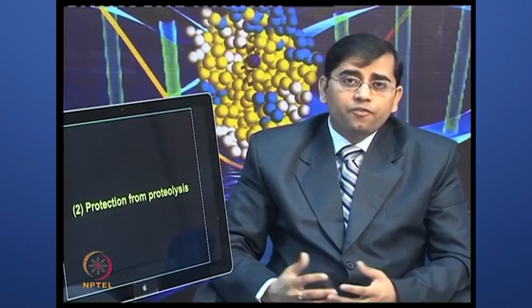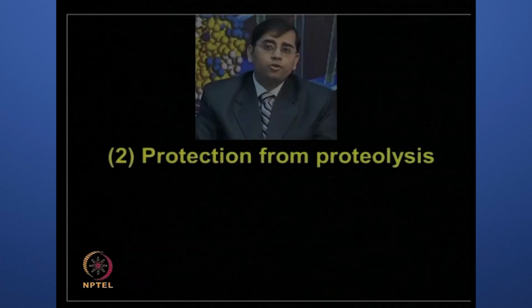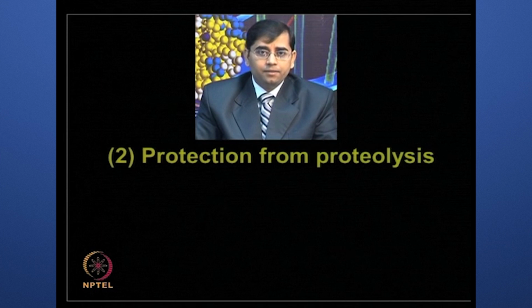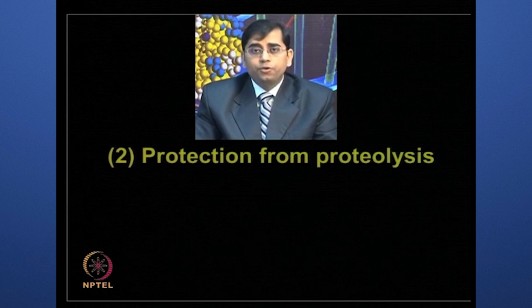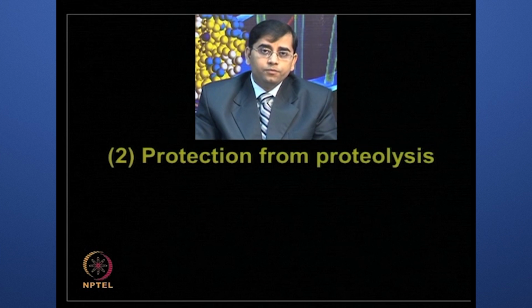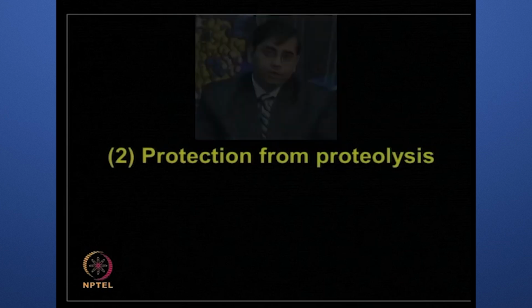Now, you have tried to break open your cells and release all the protein components and other cellular components present inside the cell. But often during this process of grinding and lysis, you may degrade some of the protein, and you need to ensure that you protect your protein from the proteolytic activities of various enzymes. So, protection of your protein components from the proteolytic step is very important during the protein sample preparation.